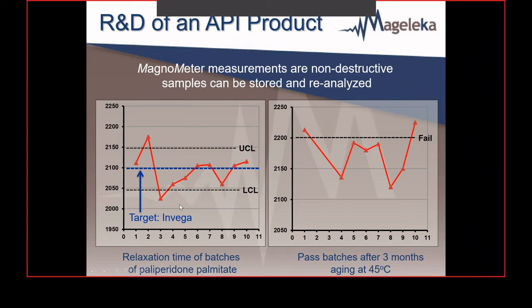This is because in any new drug application, certainly to the US FDA, in any metrics that you give them, they will allow an error of plus or minus 10%. So I just arbitrarily drew this line here. If I do that, you can clearly see that two of these batches are out of spec. It's very simple. To do more than this, you'd have to do more method development, etc. But I simply showed that of the batches they sent me, if I draw this arbitrarily, two of these are out of spec.